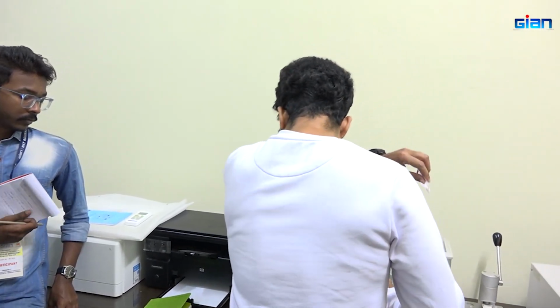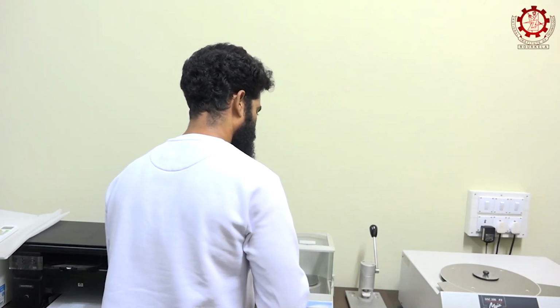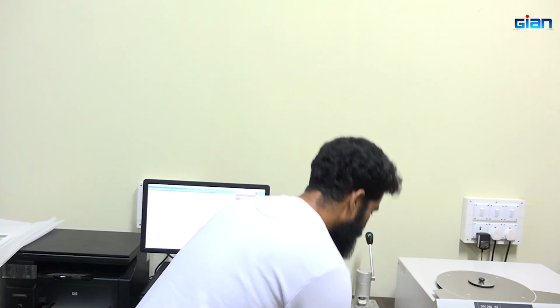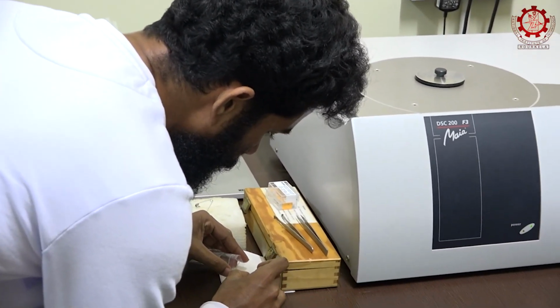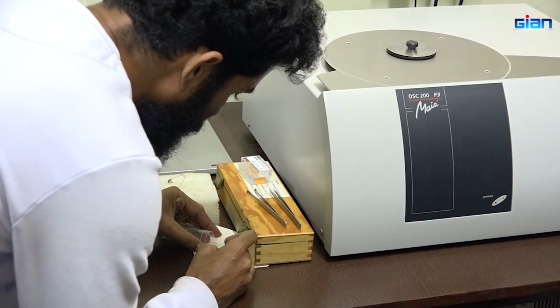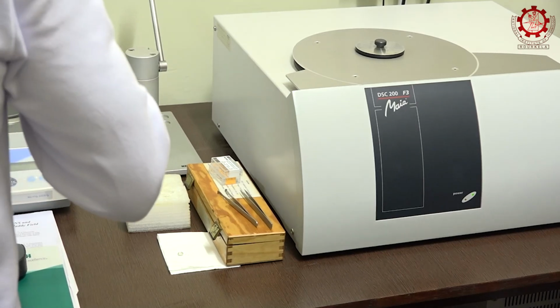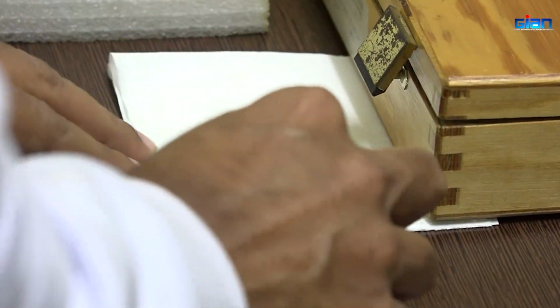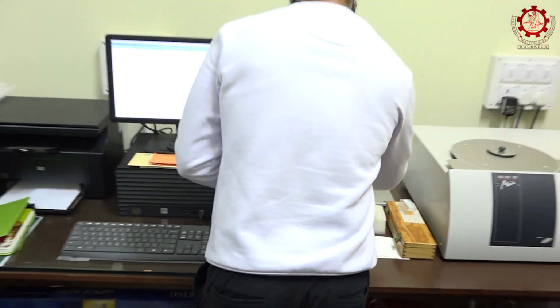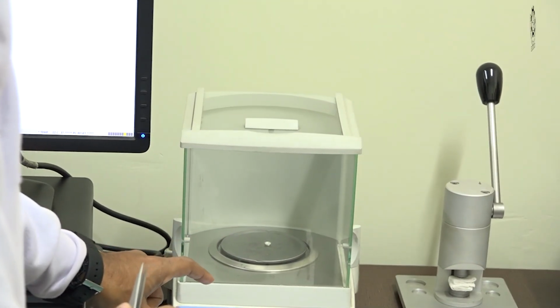Now we'll put the sample. Now it is showing 26 and the pan itself is 23. The sample weight is 3 mg.